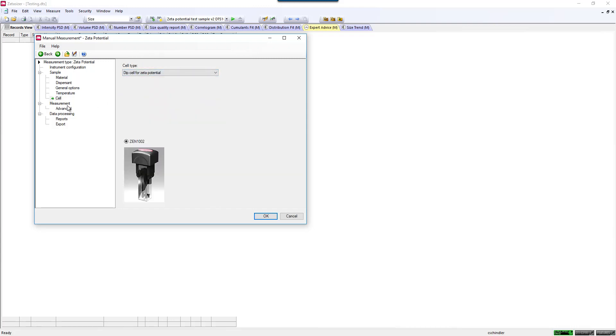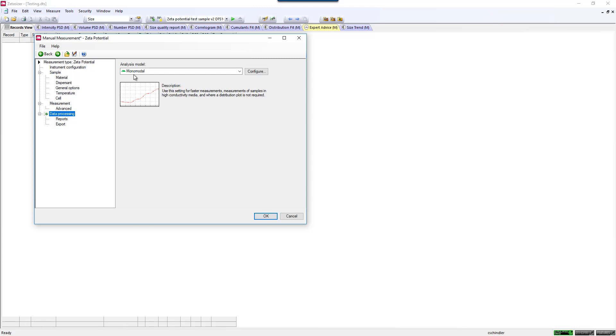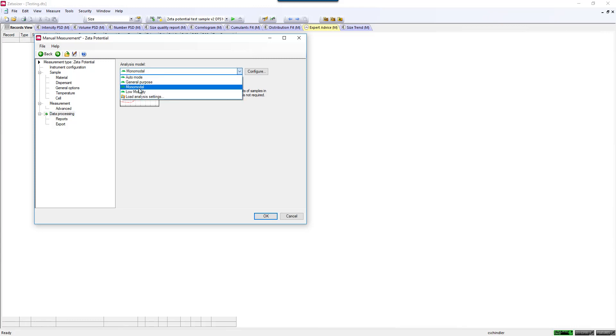There is also another specific mode that's used specifically with the dip cell for organic solvents. This is the low mobility mode. Notice it's not activated until you select the dip cell. This is what you would select to make a measurement with an organic solvent.